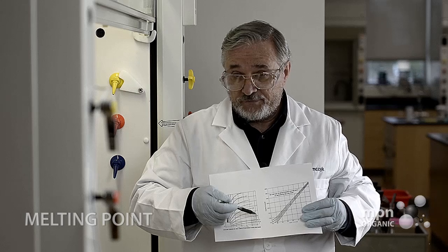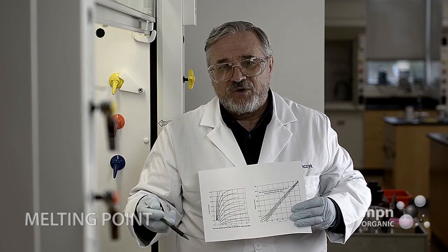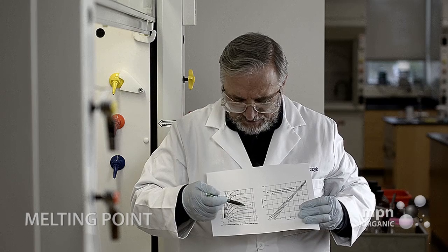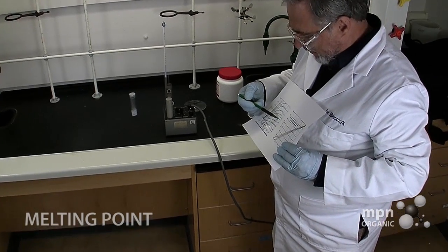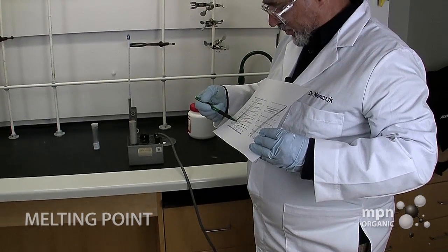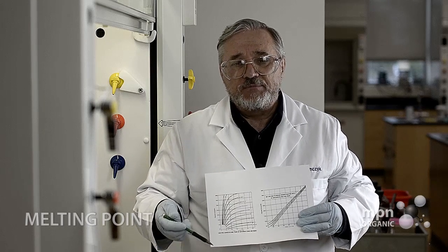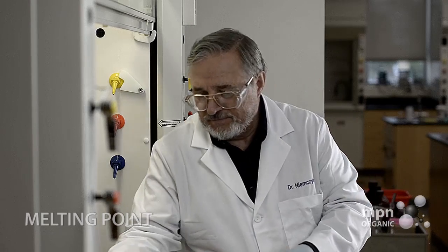Okay. It's 141 there in about 30 minutes. But I know all of you are impatient, so if you were to set it higher, let's say you set it at 60 volts, well, it would go up to 228 in a space of about 25 minutes, and it would certainly pass 135, in, let's see, 135 is right about here, in about 10 minutes. So you could actually take the melting point of this sample and get out of lab on time.